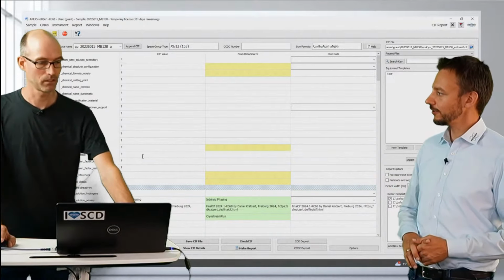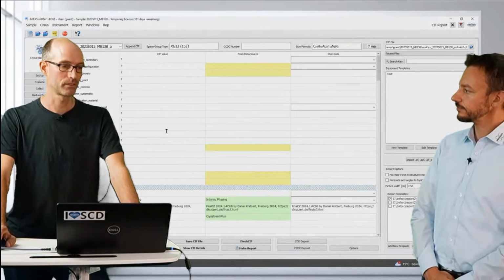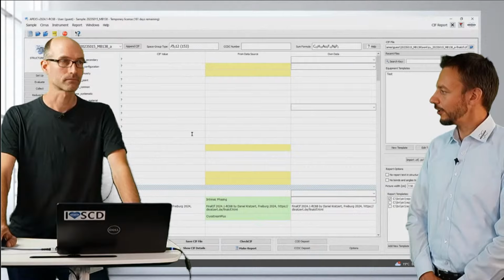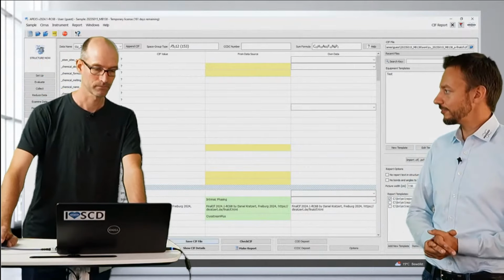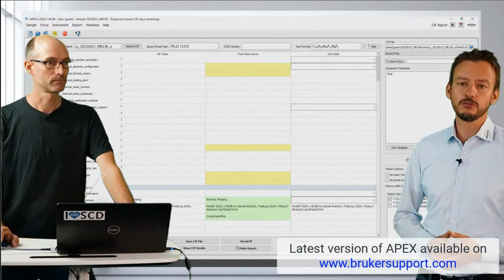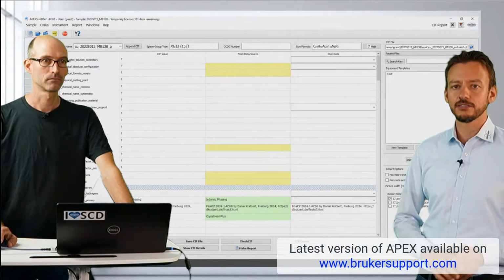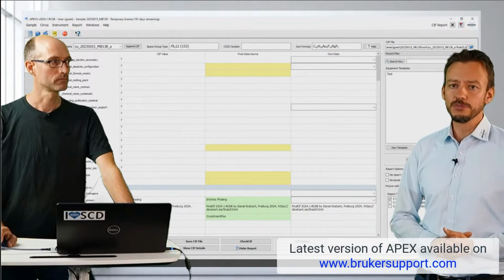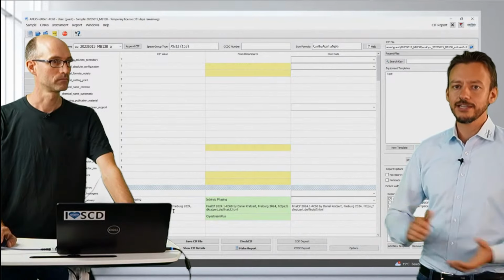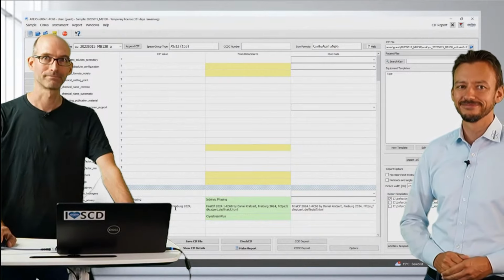Yes, of course. And I really recommend doing everything inside of Apex so that FinalCif at the end has all the information it needs to complete the CIF. Okay. Then, thanks, Daniel, for this very nice introduction. You're welcome. This is now available in the latest Apex version you can download from Bruker support. If you have any comments or feedback, you can always directly contact the applications team, Daniel, or me. We will have a Q&A session after this webinar. Thank you for listening and have fun with the new functionality in Apex. Thank you.